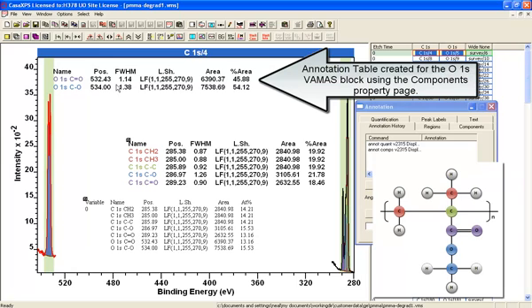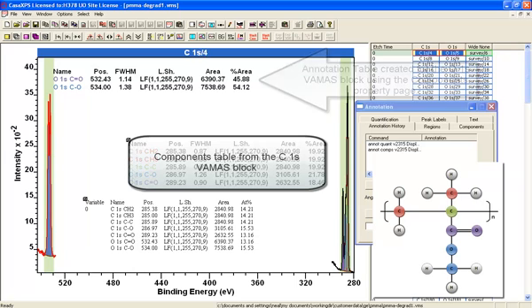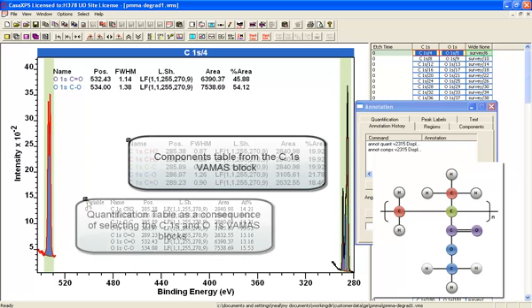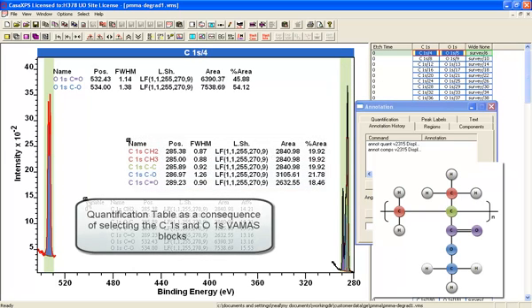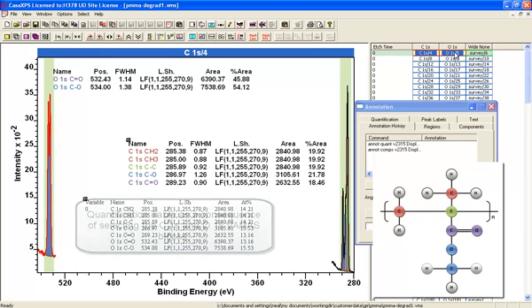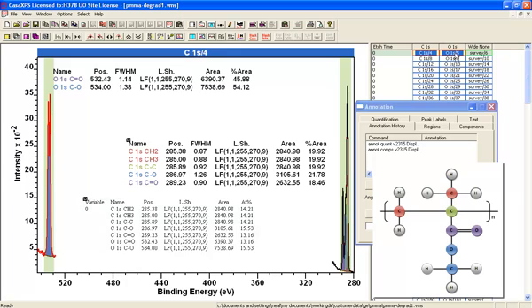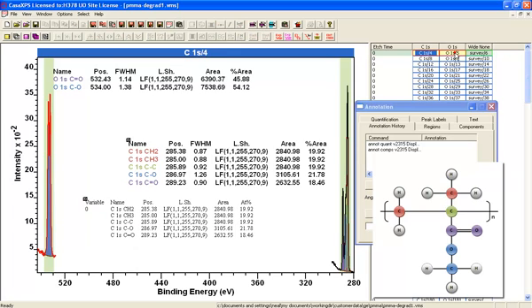The first table is coming from the oxygen. The second table is coming from the carbon only. And the third table — this is the quantification one — is coming from the vamus blocks that are selected on the right-hand side. If I deselect the oxygen 1s, we can now see just the carbon, getting the same results shown here.